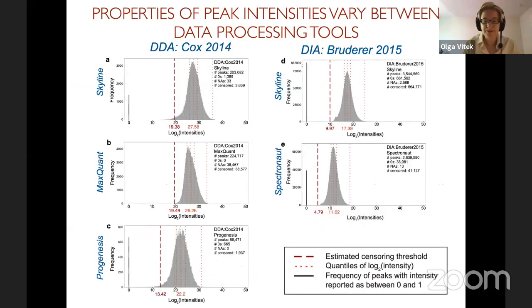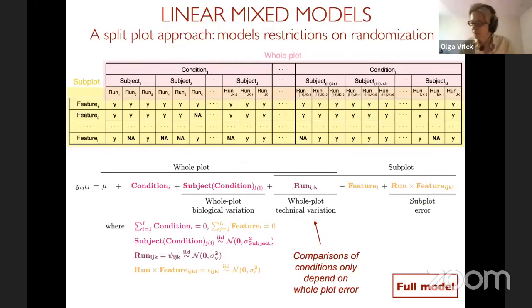Okay, so the second, let me maybe just take a few questions. So do we need to run blank samples between randomized runs to avoid possibility of significant carryover? This is a good practice. Whether you need to do it between every run or between that many runs, I think it depends a little bit on your setup, but generally it is definitely a good practice to eliminate carryovers.